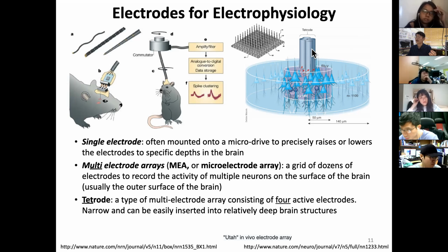Then what you get, these electrical signals, now you have to solve the problem of these signals. Different neurons have different shapes depending on the geometry and their activity, so that you can actually decompose this electrical signal and figure out how many neurons are nearby to detect. So that we call spike sorting or clustering, because these are examples of two neurons' electrical signals. Okay, hopefully this makes some good sense to you.